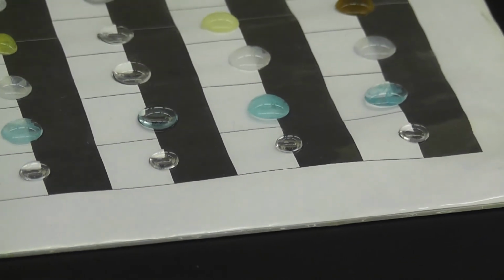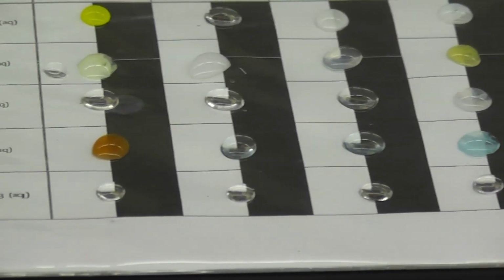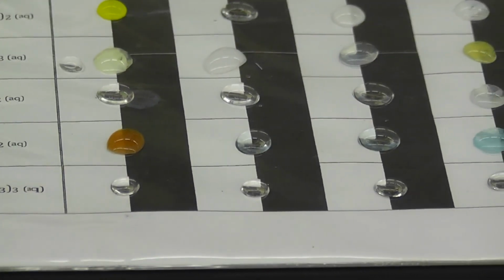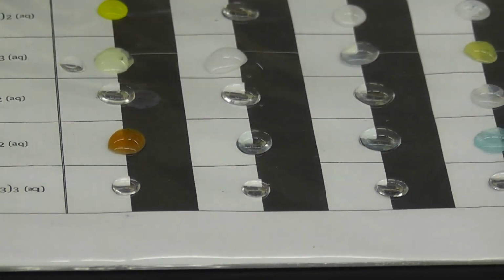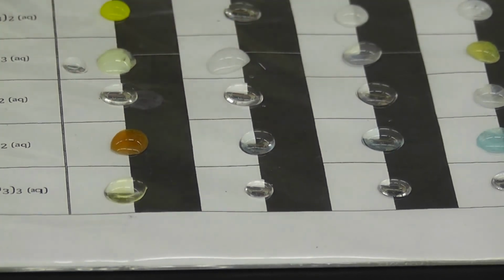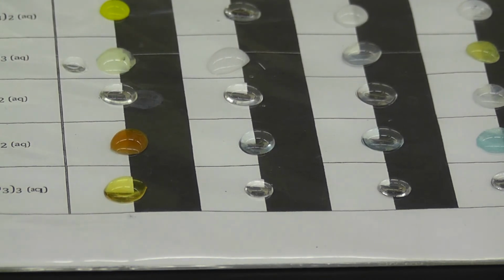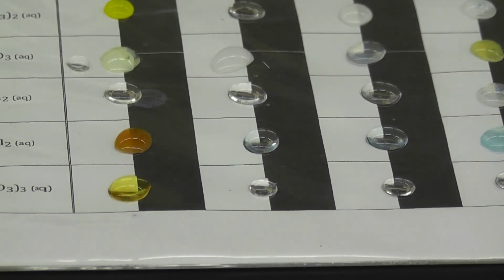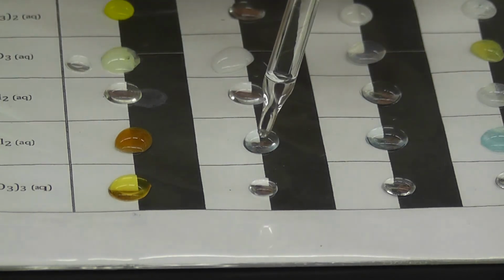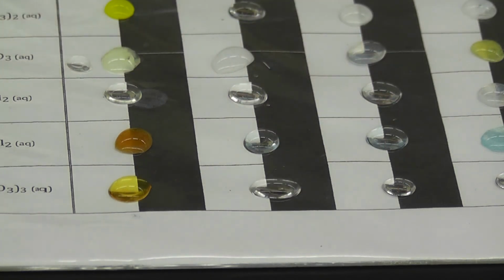Now we're doing the corresponding top values. So the first one is potassium iodide that I'll be adding to the iron 3 nitrate. So I'm adding 1 drop of potassium iodide to the iron 3 nitrate, and that's what it looks like. Okay. Next is adding sodium chloride to the iron 3 nitrate. So this is the sodium chloride drop adding to it. 1. Okay, that's what happened there.